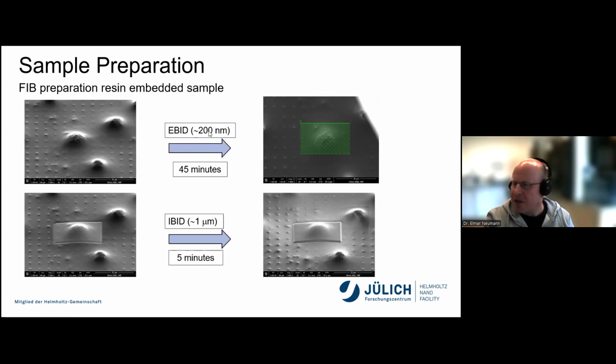The first thing that we do here, with this electron beam deposition procedure, is add a protective layer of platinum or platinum carbon. I will refer to this as platinum in the future, even though I'm very well aware that it's not just that.